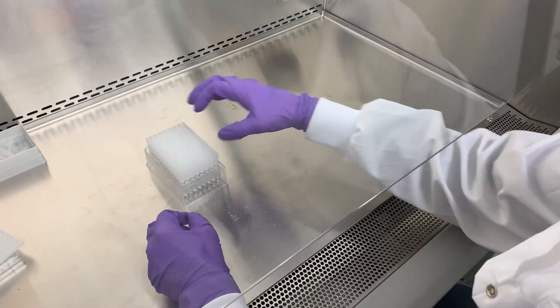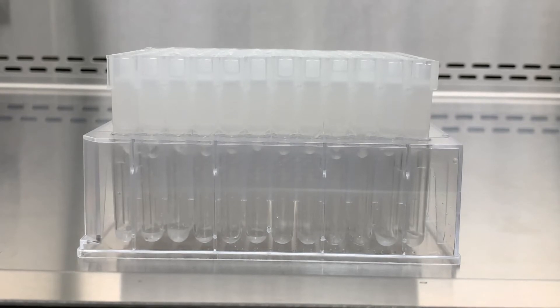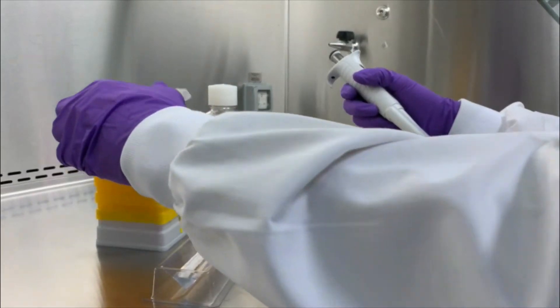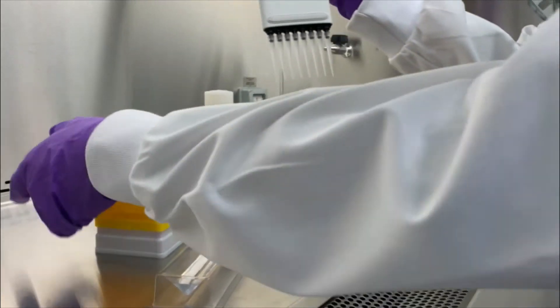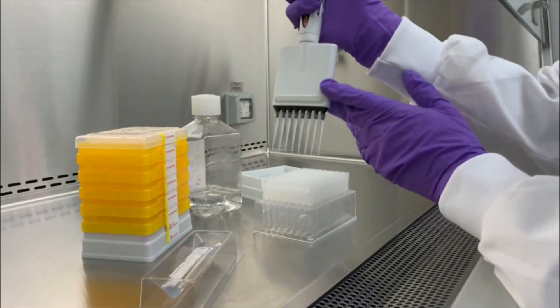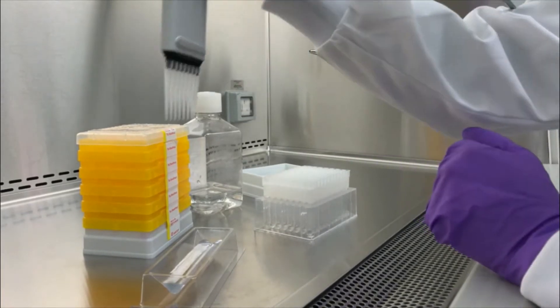Once the sealing mats have been removed, we're ready to equilibrate the column. First allow the preservative storage buffer present in the columns to pass through, but do not allow the column to dry. Next, apply 250 microlitres of PBS to each column to begin equilibration. Once this has completely entered the column resin bed, repeat again using another 250 microlitres of PBS and allow it to enter the column resin bed to complete the equilibration.